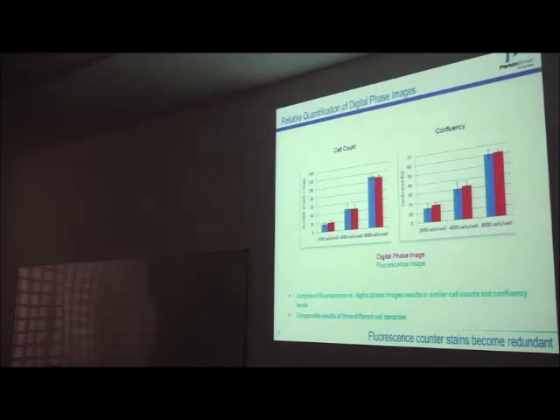Right? And that's just to correlate these numbers, like cell counting or confluency, using the two techniques. So it's pretty personalized.